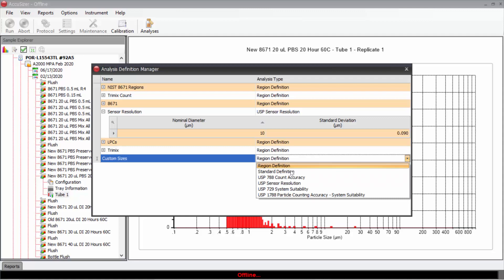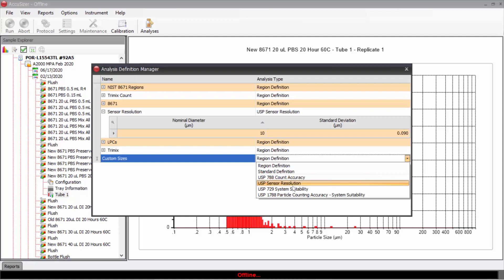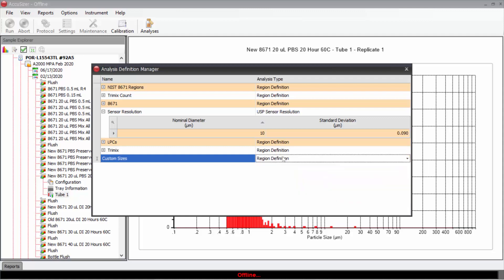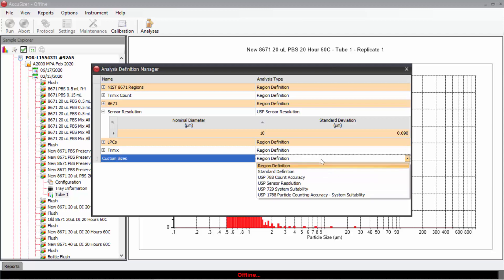Region definition, standard definition, or all of these are used for USP testing in the pharmaceutical industry. I will choose regions definition.